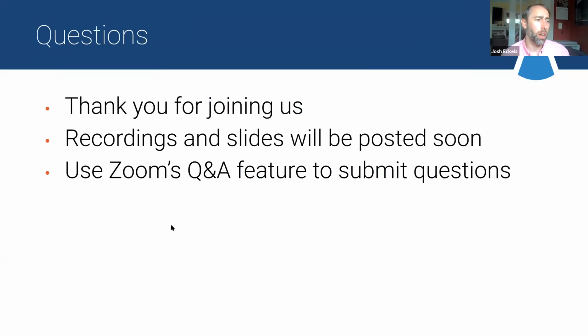Yeah, I think in general, if folks are getting errors or having things crash or not upload as expected, definitely encourage you to use the Skyline support portal, and if you can share a data file or give us log snippets or things like that, we can help troubleshoot, ask for specific things. But I think we'll probably need to dive in a little more to the specifics to figure out what might be going wrong in that case.